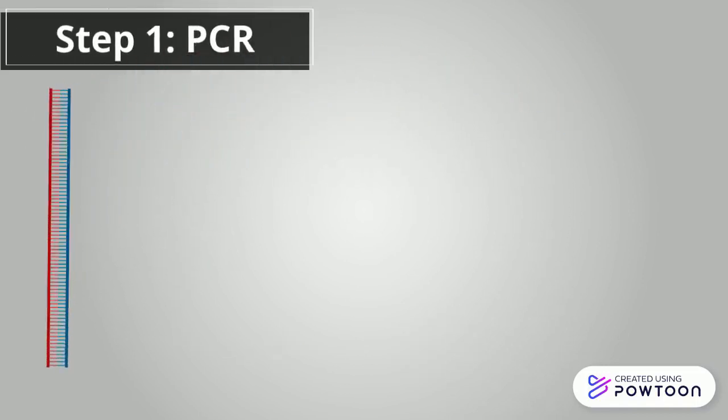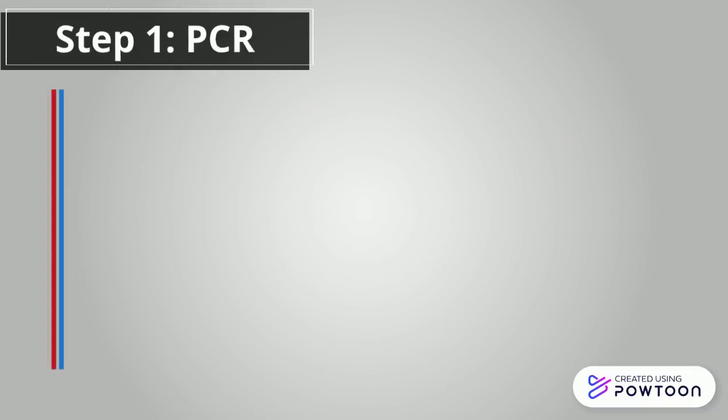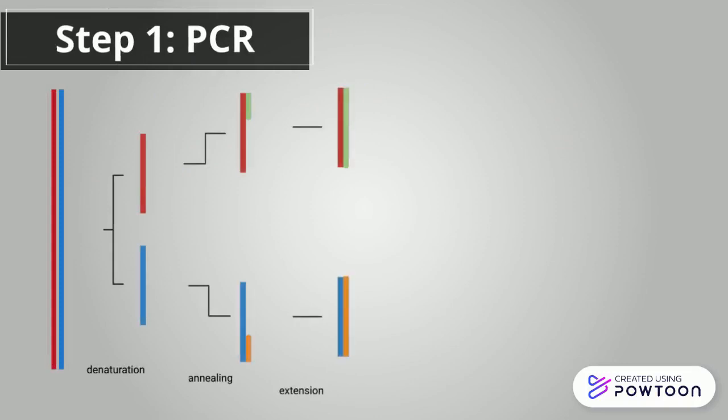Our first step is PCR. We will take the lac operon and amplify it through denaturation, primer annealing, and extension to create a pool of lac operon fragments. Next is end filling.